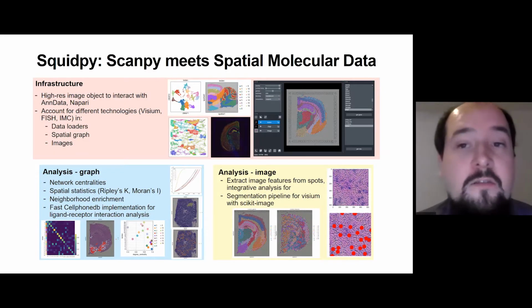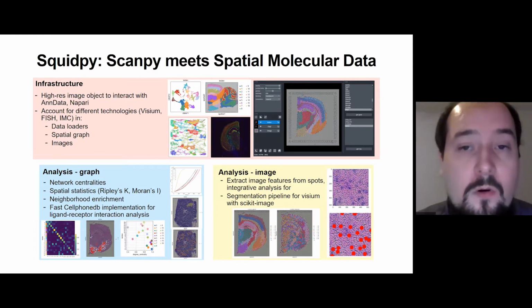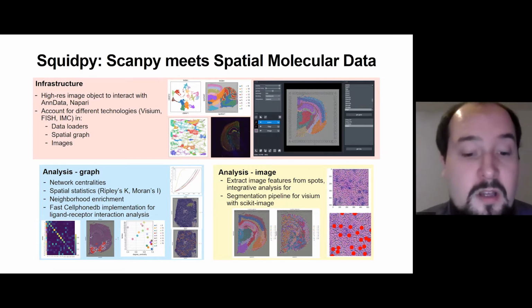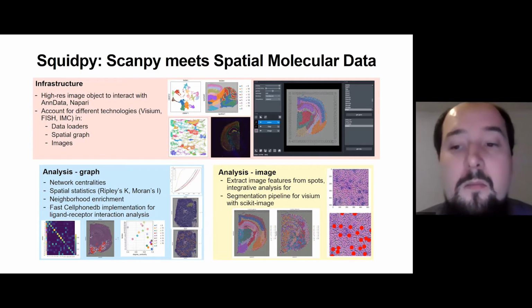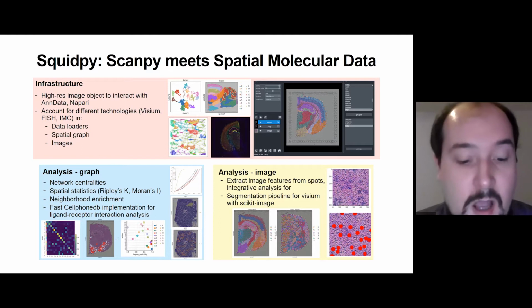Yeah, hello to everybody. I'm Sergey, one of the developers of Scanpy. And today I want to tell you about some developments around Scanpy. First of all, I want to advertise Squidpy. It's a package for analyzing spatial transcriptomics data, which will be released soon, in a few weeks. It's fully integrated with Scanpy and AnnData and uses many of their capabilities for visualization and analysis.